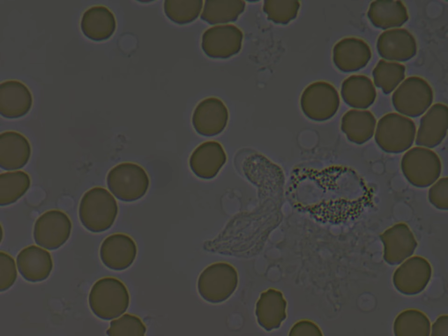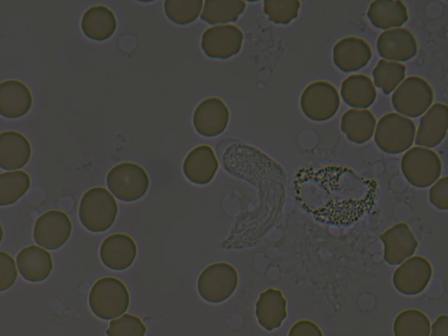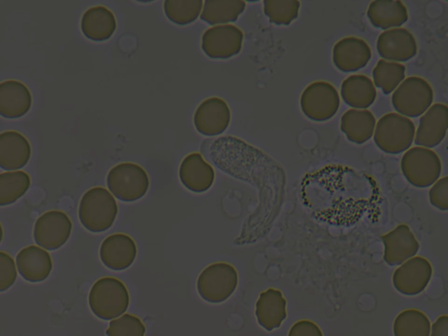In normal individuals, eosinophils make up 1 up to 3% of white blood cells and are about 12 up to 17 micrometers in size, with bilobed nuclei, while eosinophils are released into the bloodstream. They reside in tissue.